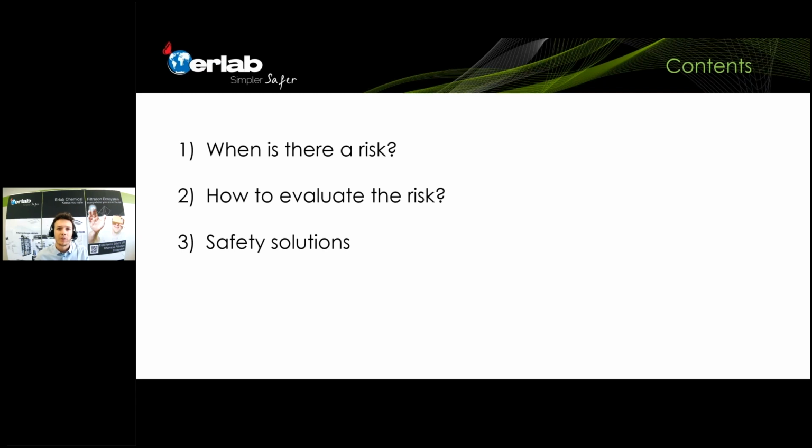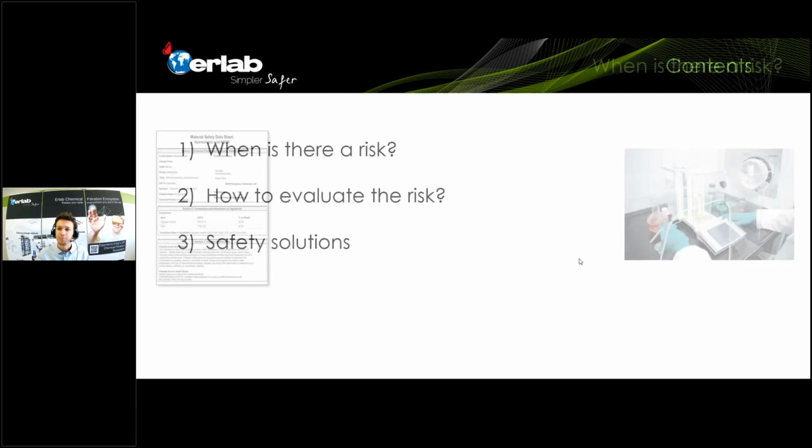It's very important that when you are working in a laboratory in an environment where you work with hazardous chemical products, you look for where that risk is situated exactly. What's the source of the risk? How do we evaluate that? Because there are certain methodologies that you can use to look for the best solution to help minimize that risk. So these are the things that we will discuss in this webinar.